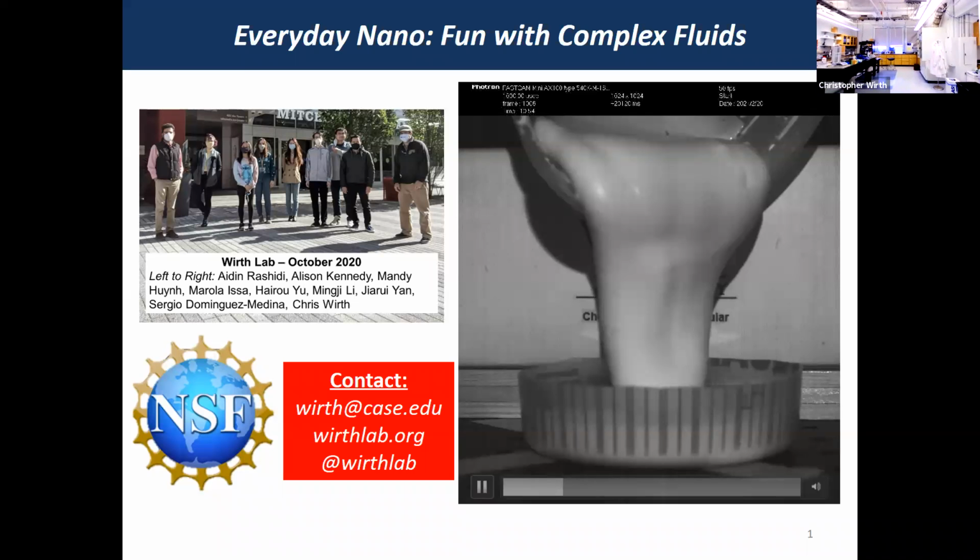And as we move along here, you'll see a couple of vent hoods. One of the major tools in our lab is that of microscopy. Okay, so we have a couple microscopes, some of which are more off-the-shelf microscopes, and some are custom. So this is one of the off-the-shelf microscopes that we have. It's an inverted microscope, which means that you look at the sample from underneath.